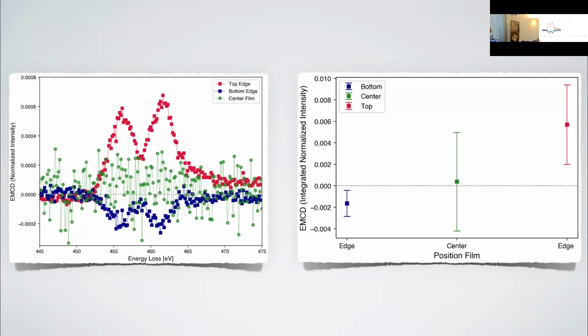And I have more data showing that when you see oxygen at other edges, in other samples, the magnetic signal gets quenched. So this sample was a lamella? No, it's a foil, grown by sputtering on a silicon nitride membrane. And how is it that one side is so different structurally from the other side? Because it's microstructural. The edges are not perfectly defined. It's not a perfect atomically sharp interface on one side and a perfect geometric interface on the other. The grains are slightly different.